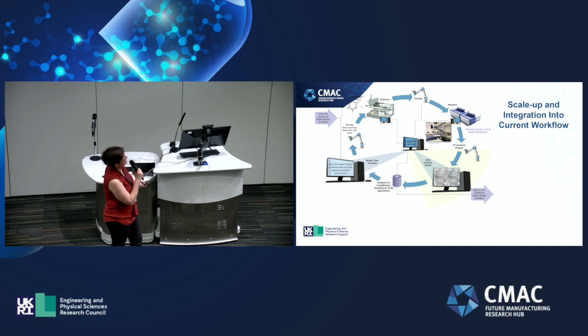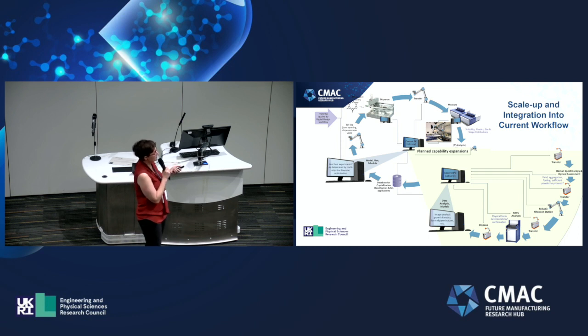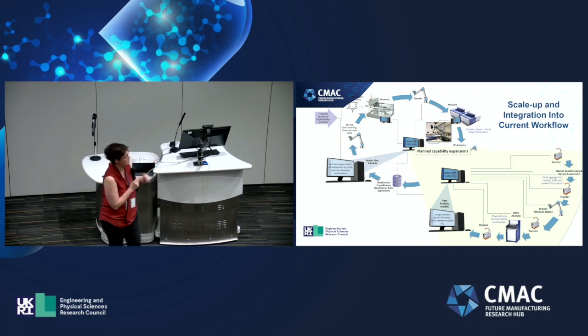So how this is fitting, I went through this workflow earlier, and these new planned stations come in. We start out with Raman spectroscopy and optical assessment. Again, that's to look at physical form, yield, look at fouling and aggregation, and particle size by an inverted microscope. Then that's handed over to the robotic filtration station where we isolate the powder, and that is going to be fed along to XRPD analysis in the Endeavour. So this is all yet to come, to feed into our crystallization classification system, so something to look forward to.